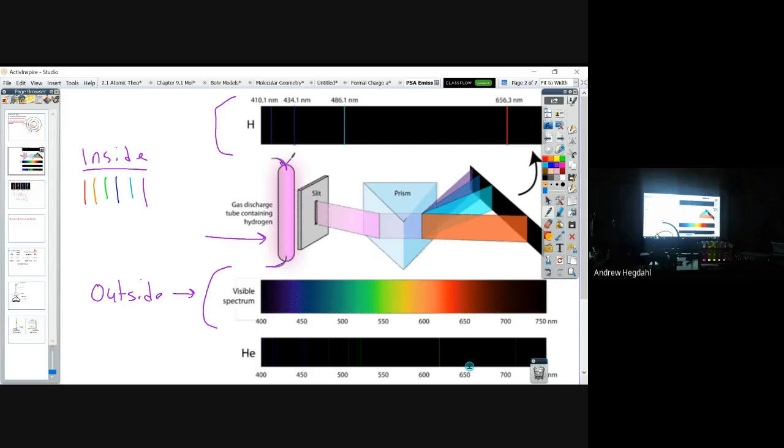So we see it's like a pink color. And now what you're going to do is you have to get at least this close to it. And you're going to take your little sight here, and you want to have this whole band of light completely fill up that space. Okay, you want as much of that light coming. So yeah, if you guys are in pairs, you can go up there. What colors do you guys see? Blue, green, yellow, red. Right. So they're all unique bands, right?